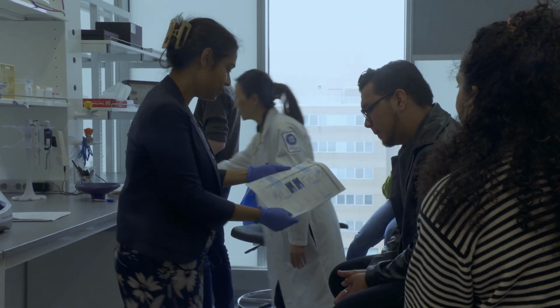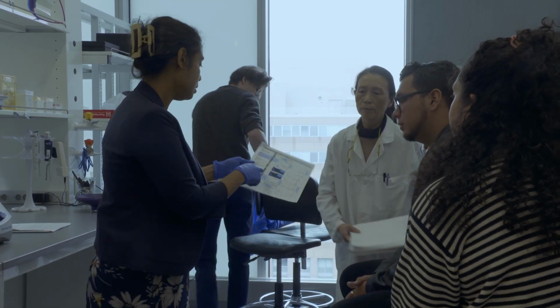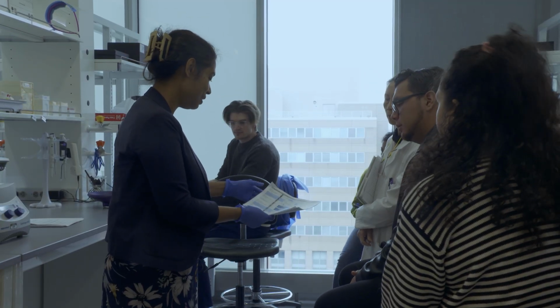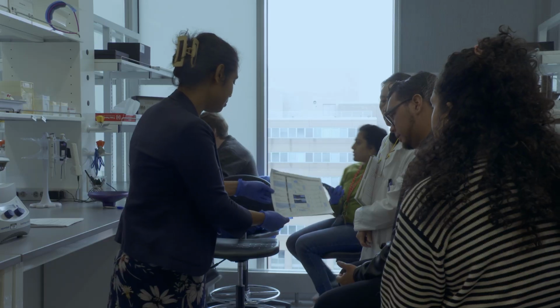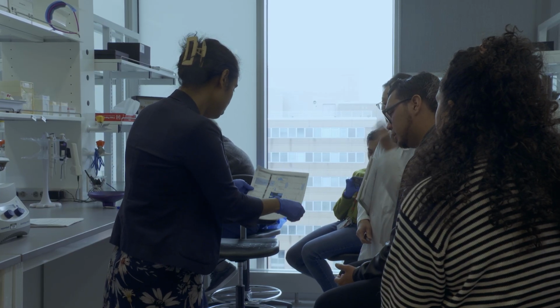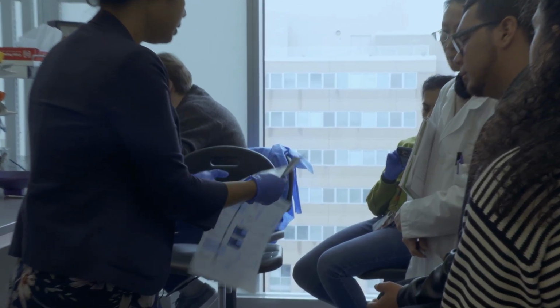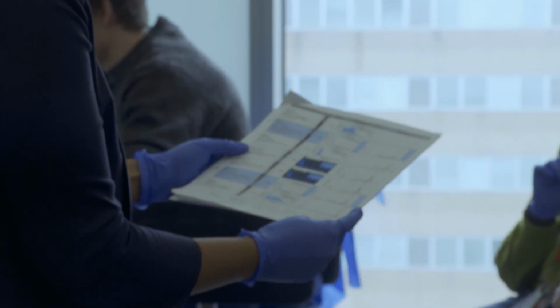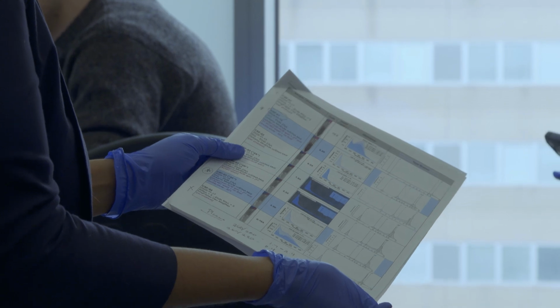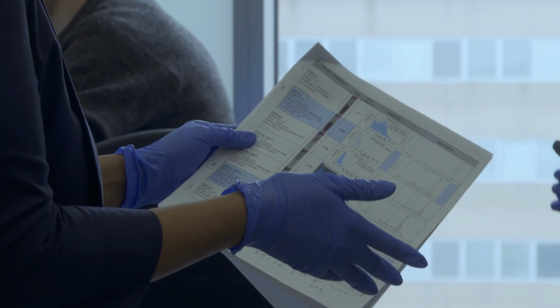So here we are going to do two pooling: 3 CSF samples and 3 plasma. I was not sure if it was visible to you. So this is CSF 01, 02, and 04. And the way we are deciding is based on which has the least amount of gDNA contamination, because none of the samples are super clean.